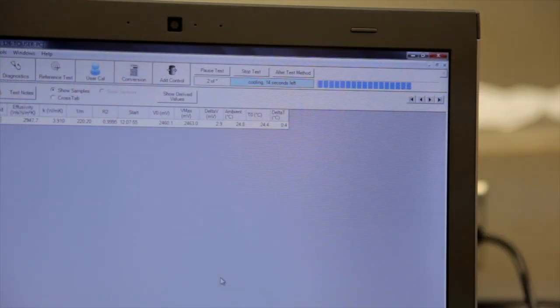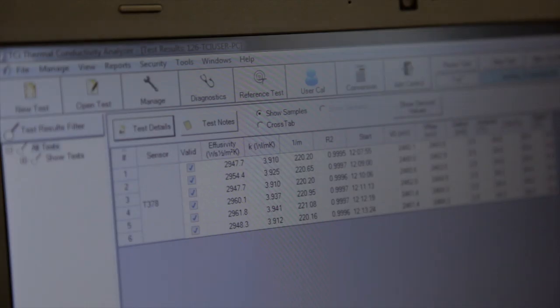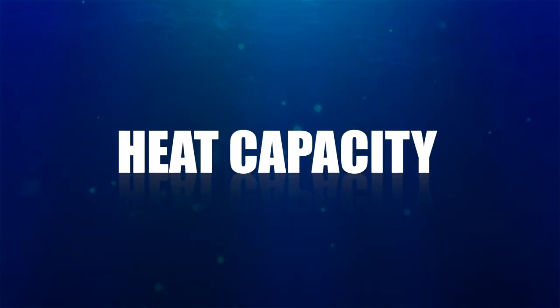The software includes a full relational database with importing and exporting capabilities, and provides the ability to derive other material properties, such as heat capacity, with additional user inputted data.